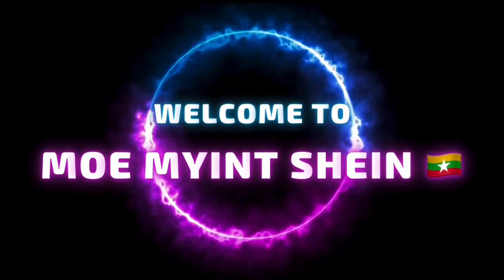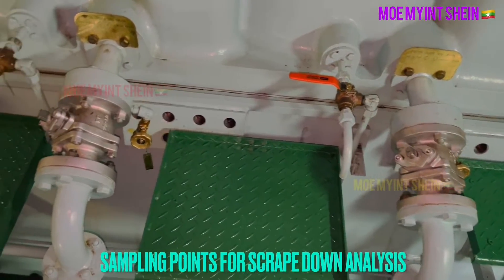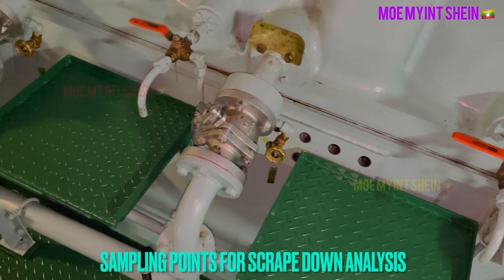Hello guys. Nice to meet you again. Today, I need to test iron content in used cylinder oil with an onboard test kit.